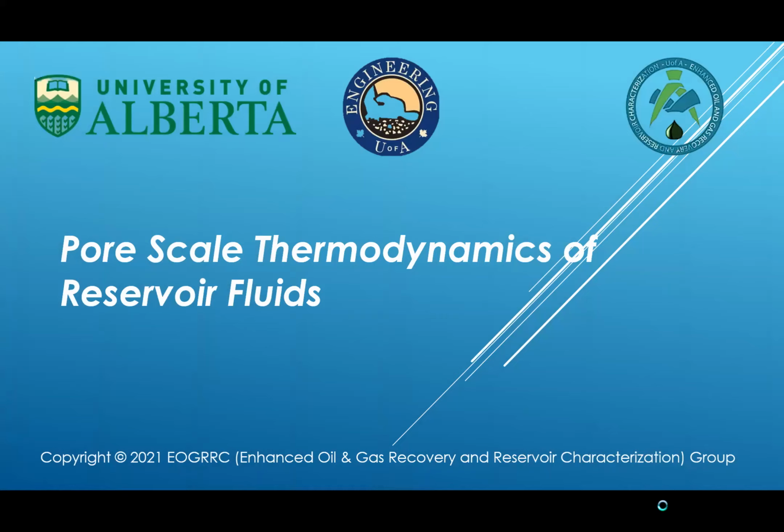A micromodel technique used to both visualize the phase change and study the thermodynamics of reservoir fluids, or hydrocarbons, will be presented in this video. We will introduce the research background, explain the experimental setup and procedure, and demonstrate 5 video samples obtained from this research.